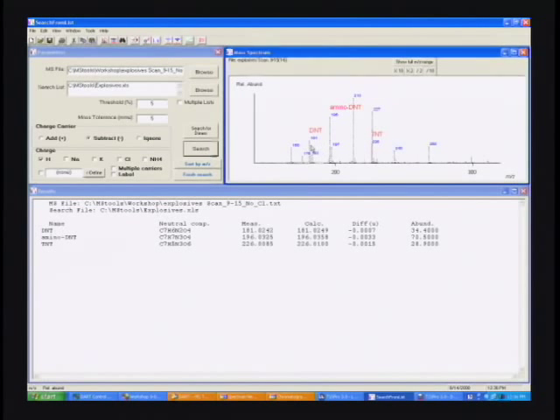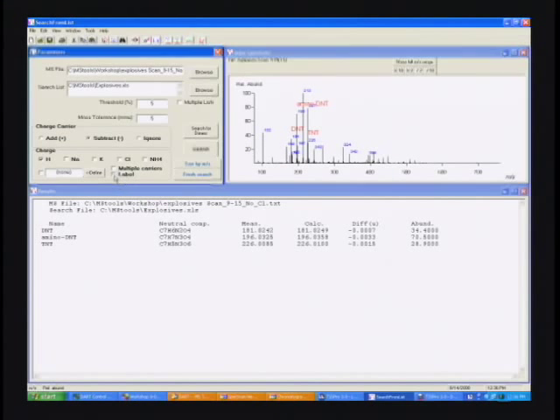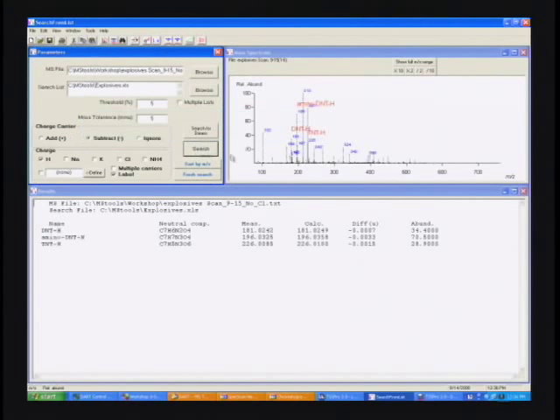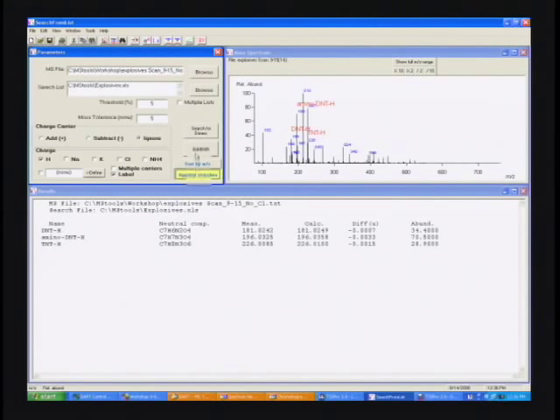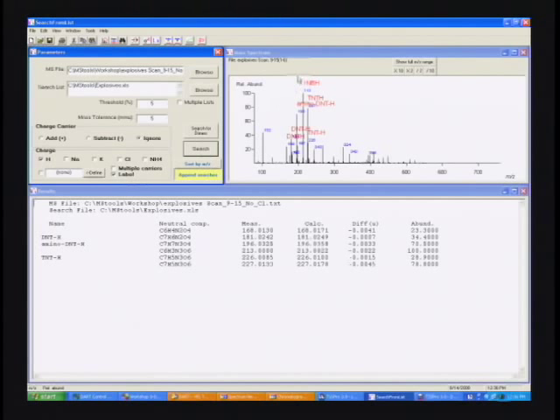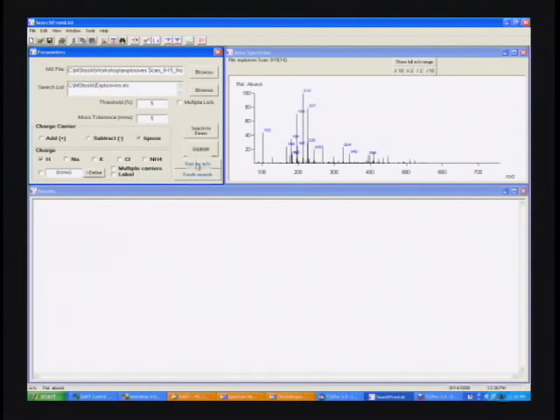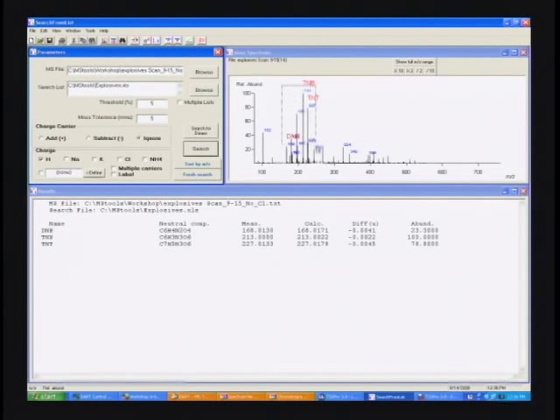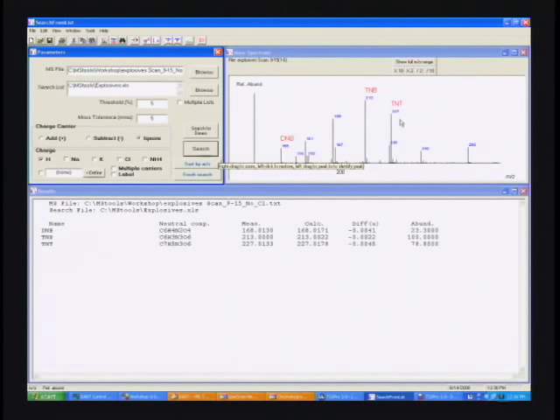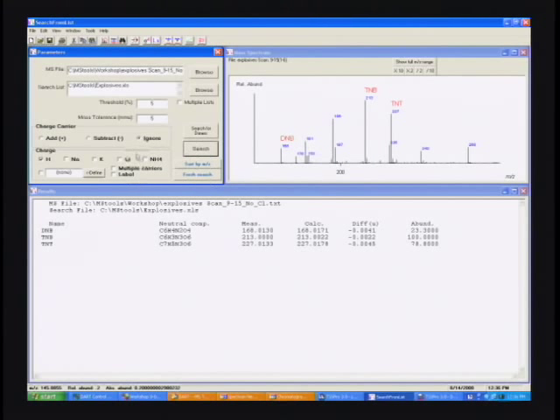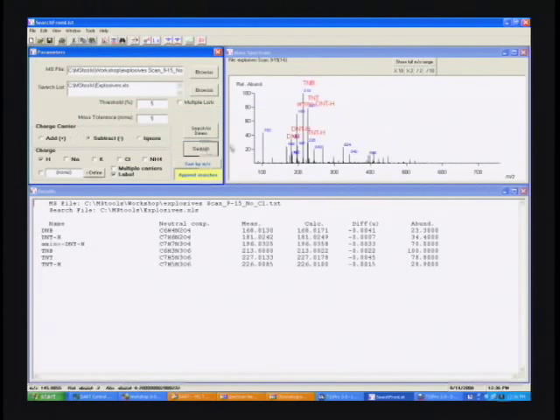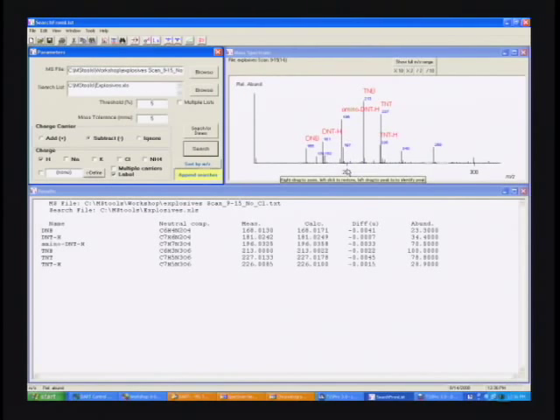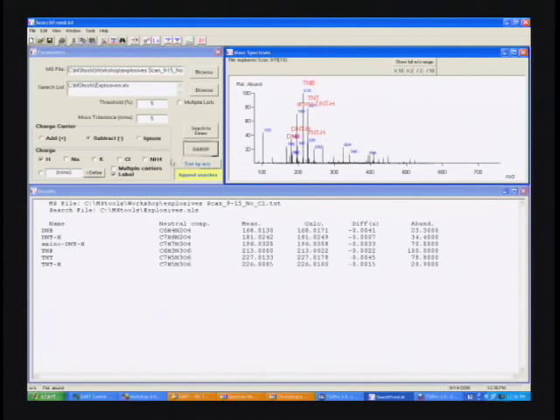It finds dinitrotoluene, aminodinitrotoluene, and TNT. Let's have it label what it did. So those are M minus H peaks. You also can see molecular ions, so let's have it label those things if it finds them. And in fact, what it finds is trinitrobenzene, dinitrobenzene, and the TNT molecular ions. So those are just M minus, and here are the M minus H peaks added onto the spectrum. And so we found, as I said, we find all the nitroaromatic explosives show up as M minus or M minus H. But notice we don't see any HMX or RDX in here. Those don't form abundant molecular ions in this mode.